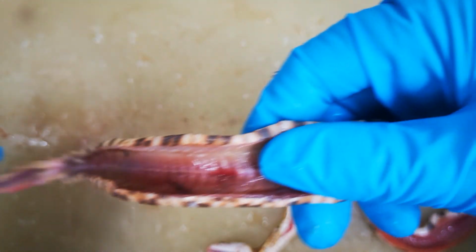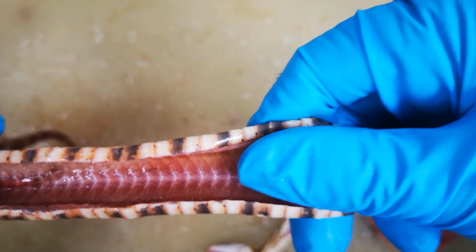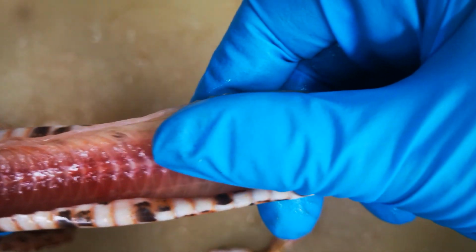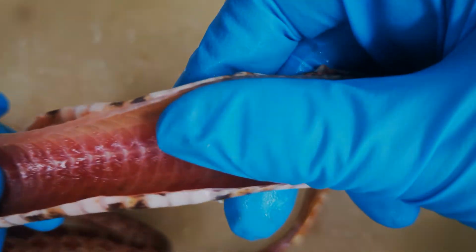With the internal organs removed, we can examine the vertebral and costal structure of the snake. Note that the vertebrae are largely undifferentiated. Each has a rib attached to it.